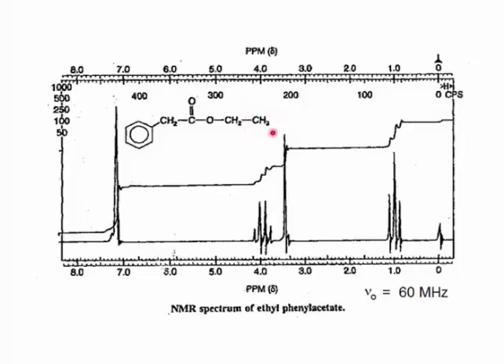All right, we have the methyl, that's one set. There aren't any other methyls equivalent to that. We have this methylene, that's the second one. Now we have another methylene, but that's in a completely different environment. So this methylene is the second set, this methylene is the third.